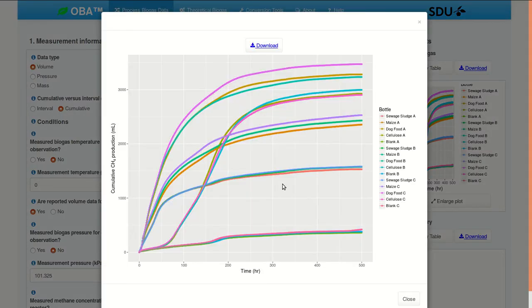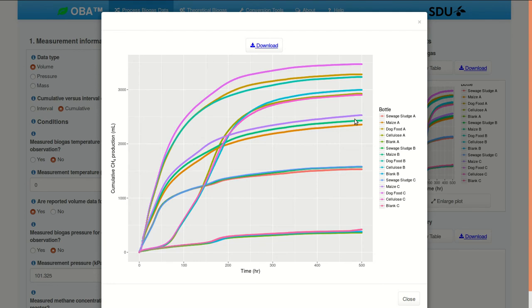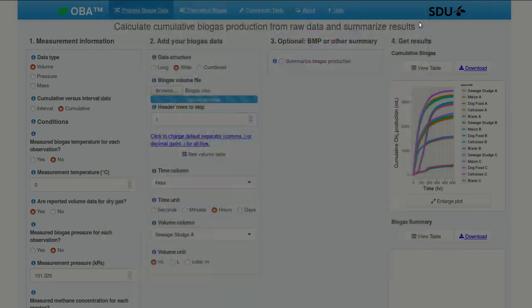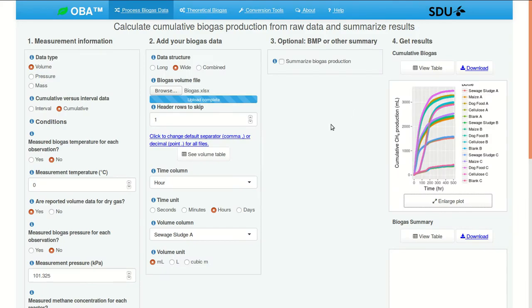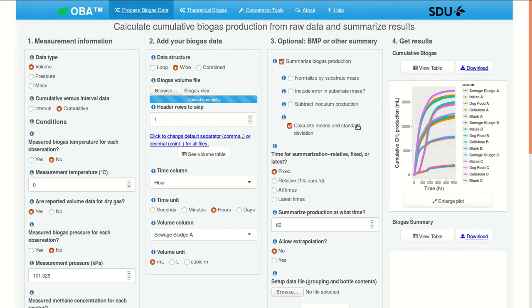Here's a closer look at the plot. You can see the lines seem to group together in twos or threes. I think they're all actually grouping in threes. And these are the replicates. To calculate BMP, we need to summarize biogas production.